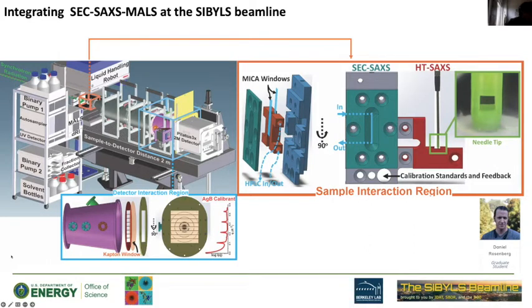This means every user has their own buffer, and this allows us to collect 8 users in a continuous way so we do not interrupt the data collection. We also have multi-angle light scattering, adding additional detectors to our collection so that we can calculate molecular weight, hydrodynamic radius, etc.